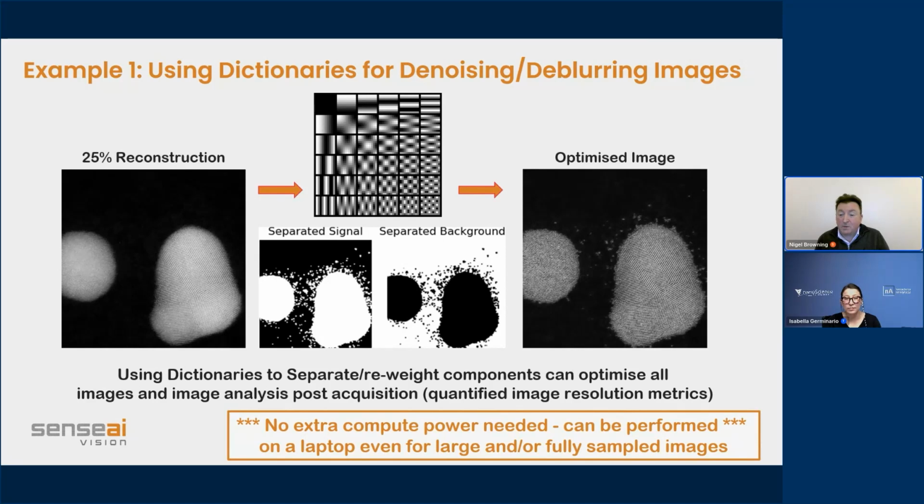So what that means is that because we can do drift correction from the acquisition of images, with the compressed sensing data set that we have, we can do a drift correction on that in that process. That's not really using machine learning per se. It's just using that to correct the differences between the images. The advantage of doing it in a compressed sensing way is that because we're acquiring fewer pixels, we're acquiring much faster images, which means you're going to get much faster feedback in terms of the correction that you have in the drift. So absolutely, we can do that with the compressed sensing.